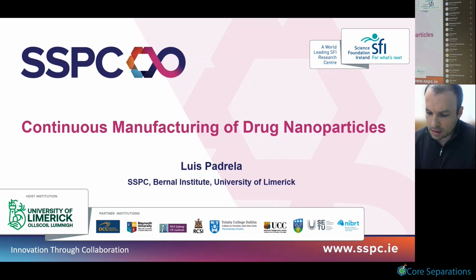So what I'm presenting today is a technology that we've been working on over the past 2 3 years, and it's based on previous technology, which is nano spray drying technology, and we have modified it to be applicable for the production and collection of nanoparticles with high yields. So it's focused on continuous production of small molecule drug nanoparticles, but it can be applicable for large molecules as well. So we use high pressure fluids, in particular supercritical CO2, to assist with the atomization of our drug nanoparticles.